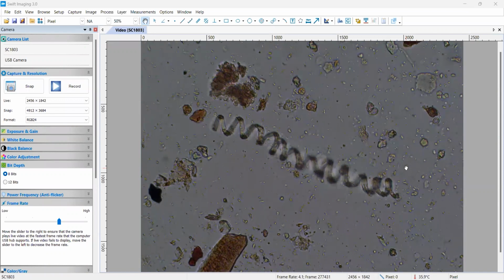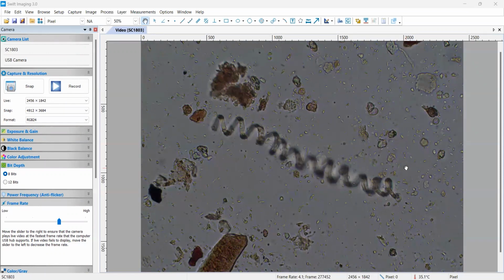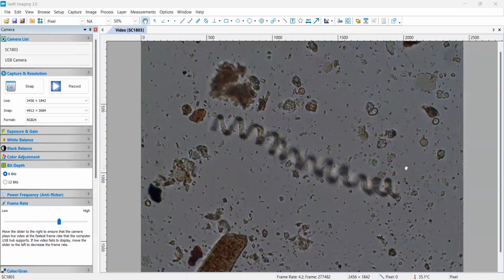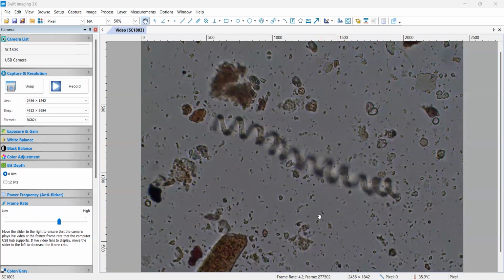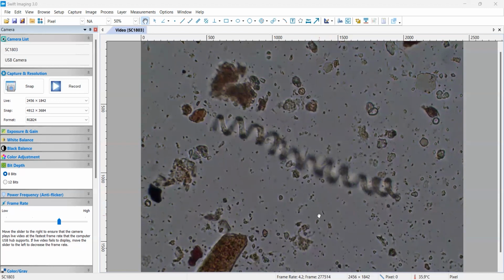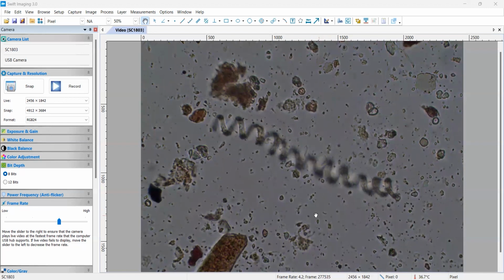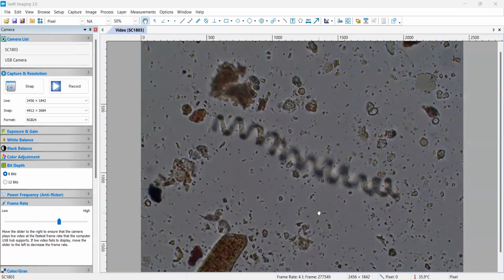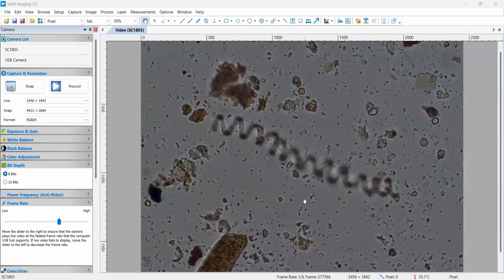So you can see the bacteria really well moving around in here. And we have interesting bacteria in here. We have cocci, and we have some rods that are moving around. So right here, this one right here, see how that's rod shaped? So that's pretty awesome. So the rod shapes, those are a bacillus. And so we have diversity in here, which is good. Bacillus are good. They're aerobic bacteria along with the cocci. So it's really good to see that.